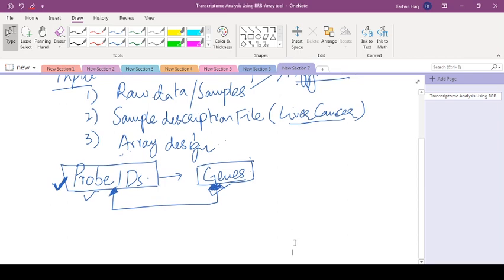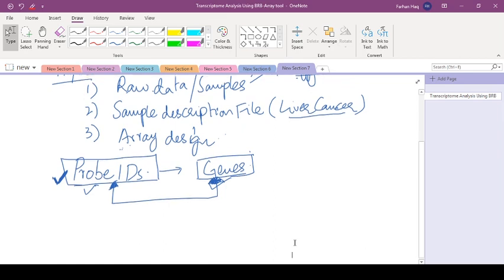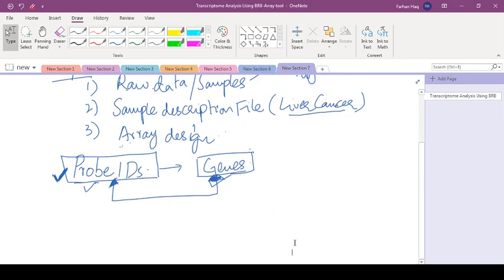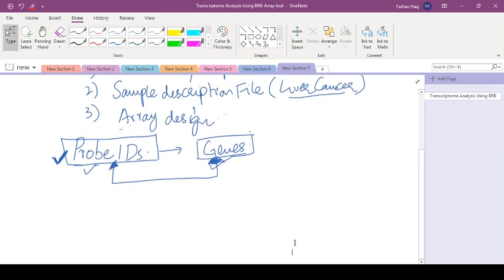So there are three things: raw data, sample description file, and array design. These three things are important before going into the analysis.